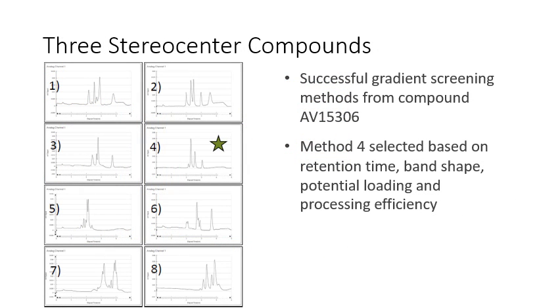So in fact, what we do is we leverage that UPLC separation that allows us to get another layer of information, and that makes it less important to what degree we separate all of the enantiomers in a single screening run. So you can see that 2 and 8 maybe produce a little bit better resolution than the one that we've chosen here, which is chromatographic method 4.